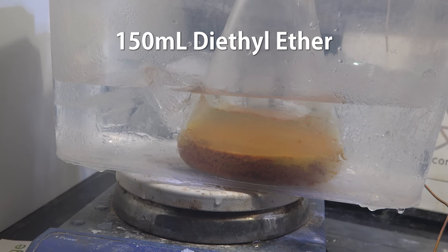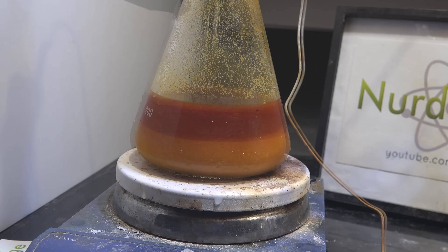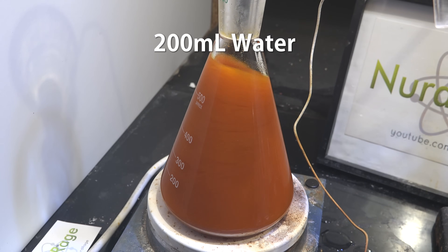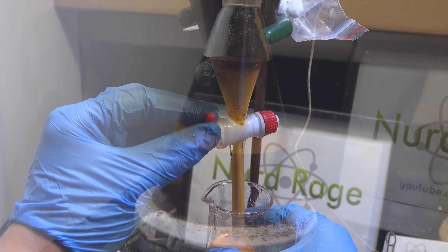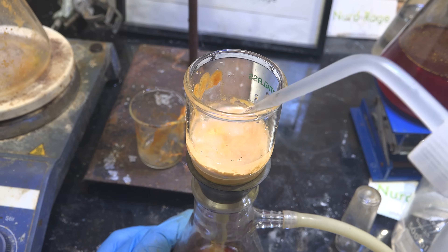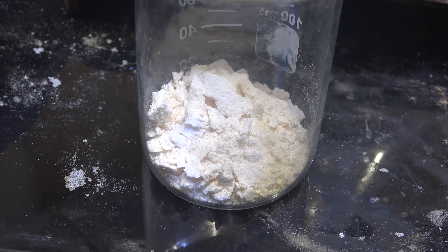Once cold, add 150mL of diethyl ether extracted from starter fluid — keeping it cold minimizes losses of the volatile ether. It looks like there isn't enough water; the aqueous layer still has large undissolved chunks. Add another 200mL of water and stir for about half an hour, then let it settle. Now we have a clean aqueous layer dissolving all the salts and polar side products, an upper ether layer collecting the nonpolar impurities, and in the middle a layer of pyrimethamine — it has only minor solubility in both so it separates into its own layer. Suction filter the mixture to get crude pyrimethamine, wash once with water and twice with ether, let it dry on the filter, and scrape it off. Our crude yield is 5.5g.